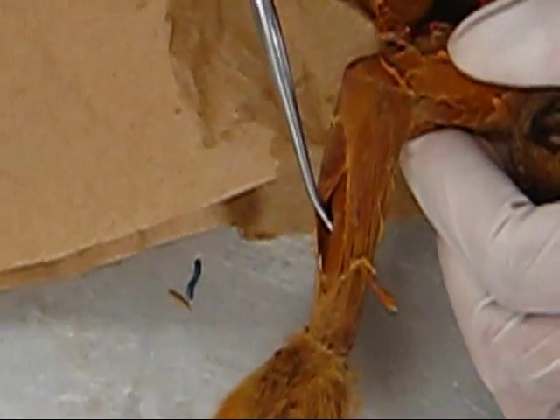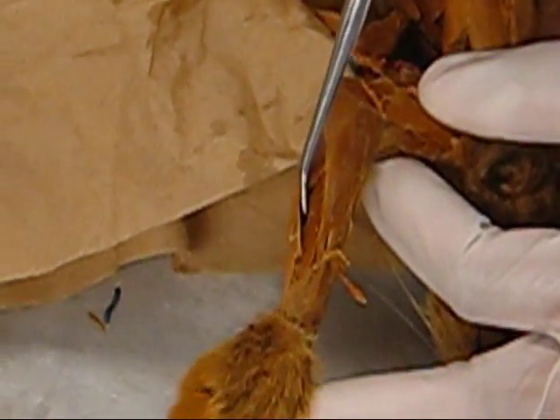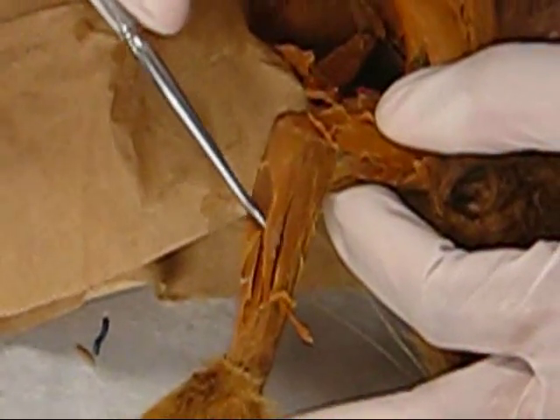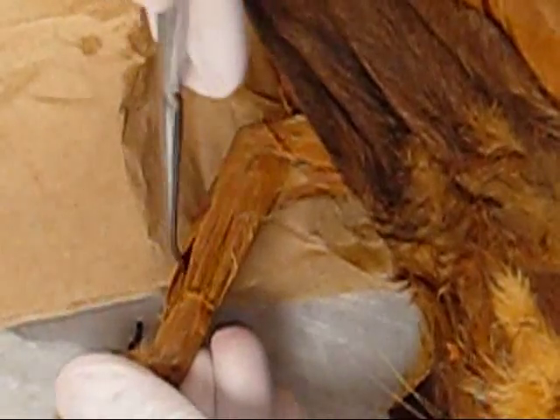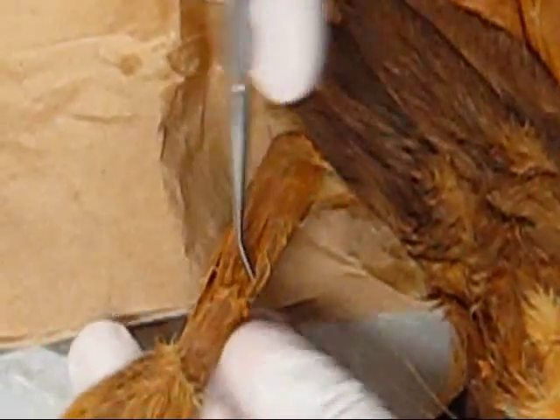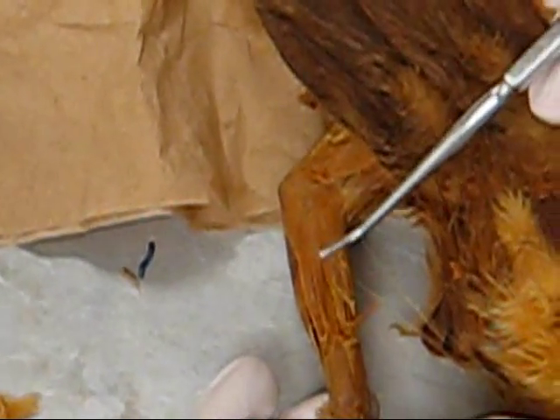And under that is the brachialis. Deep inside is the flexor digitorum — the one that's attached to this tendon right here — is the extensor digitorum communis. Those are the ones that I can identify right now.